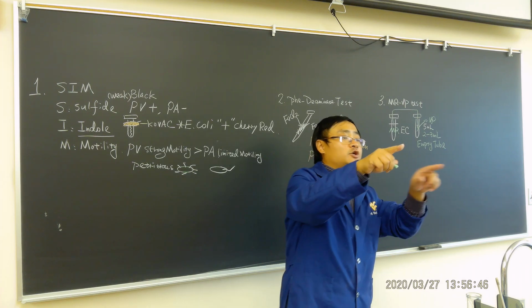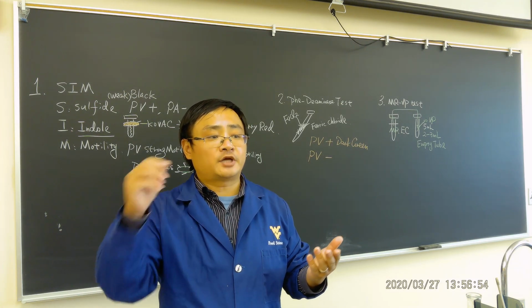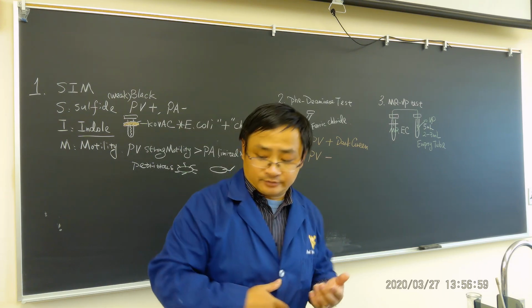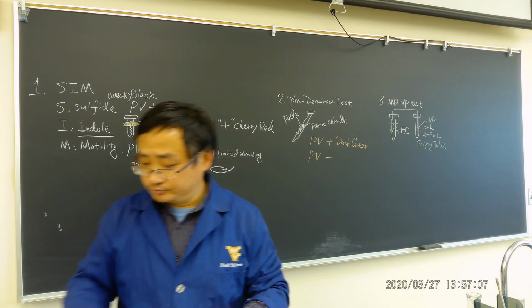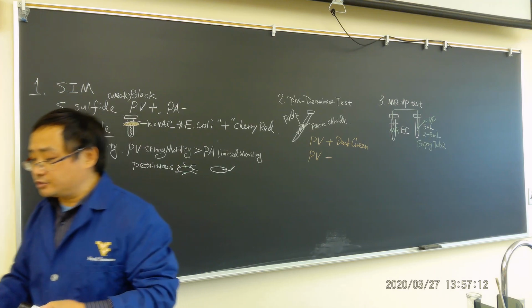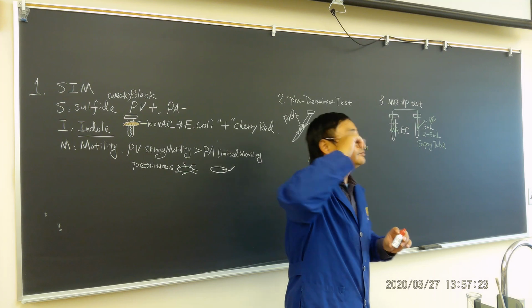Okay, you do that job first. Let's do that right now. Just dump about 2 to 3 ml into the empty tube, and mark the original one as MR and the new one as VP. So ideally we split them into two. Now I want you to do that. Everybody, okay, you did that? You all did it.